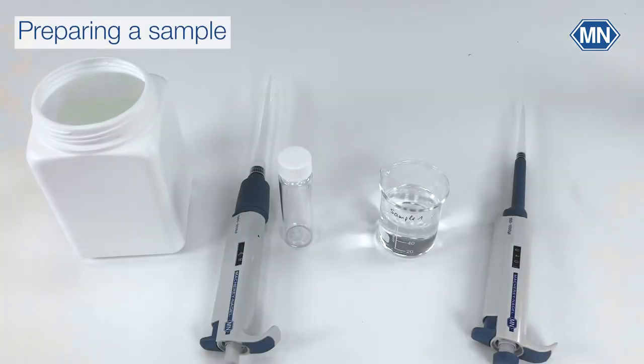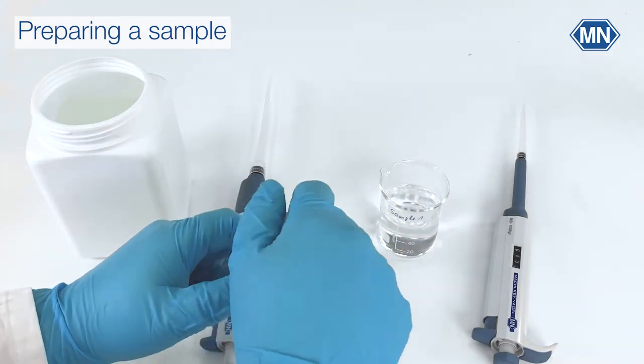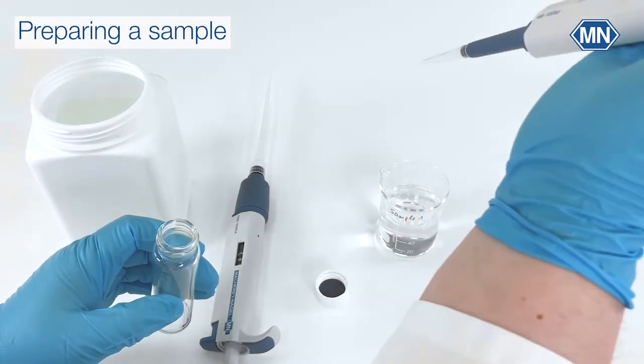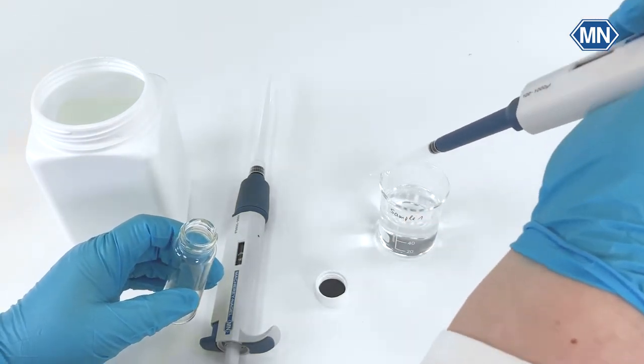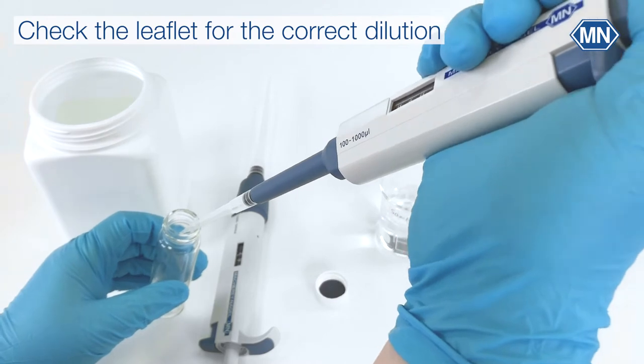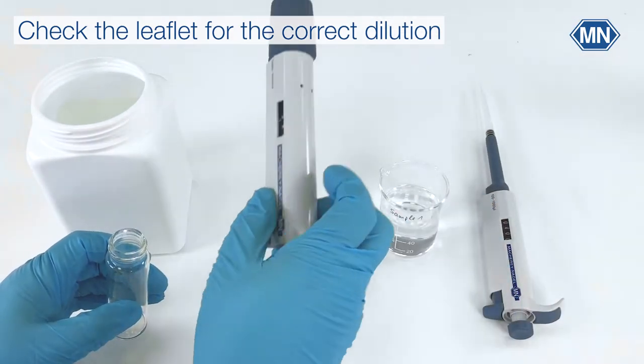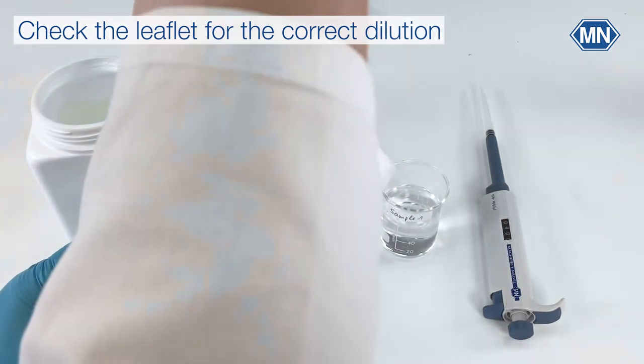According to the expected BOD value prepare a dilution of your sample and the diluting water directly in the reaction vessel. For the correct dilution please refer to the table in the leaflet of the test kit. Check for the most suitable dilution and read the volume of sample and diluting water.